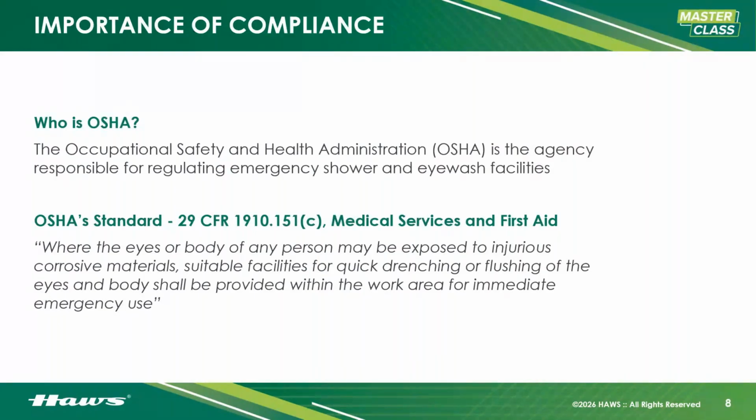Now, OSHA, most people should be familiar with OSHA. That's the Occupational Safety and Health Administration. Most countries also have something in some way, shape, or form that is an OSHA. But they are responsible for helping to maintain and regulating emergency shower and eyewash facilities. Their standard is 29 CFR 1910.151(c). You can find that in the medical services and first aid section.